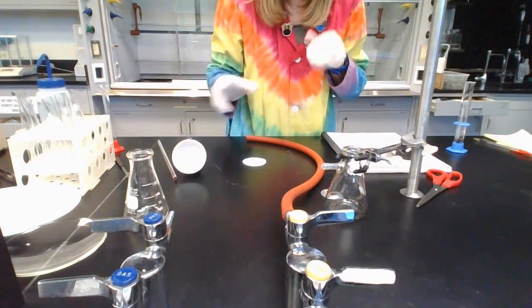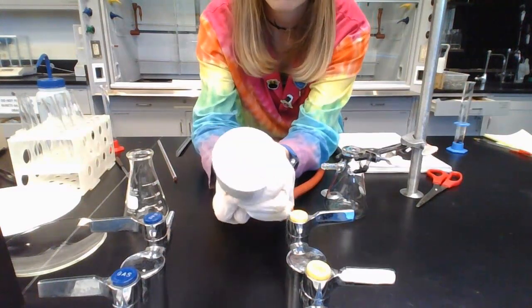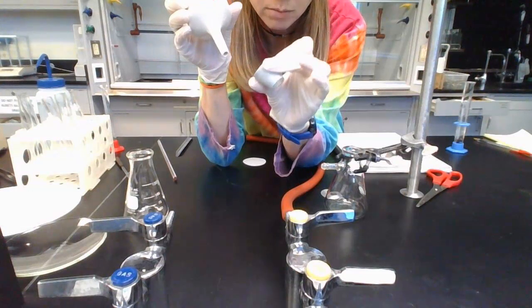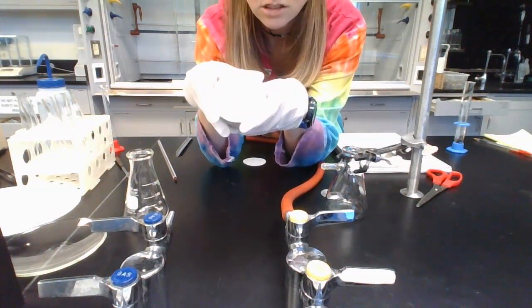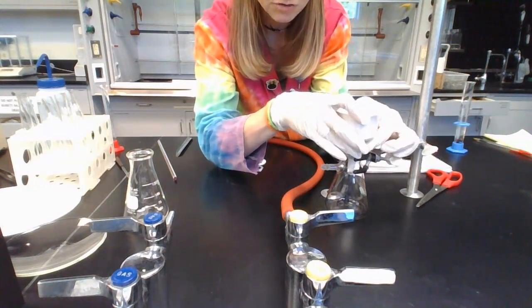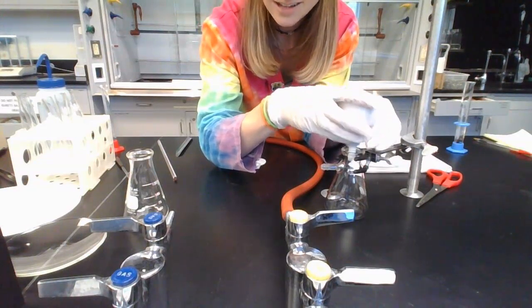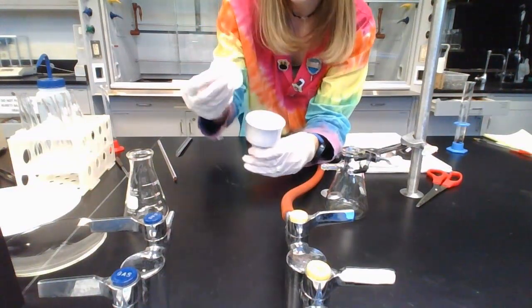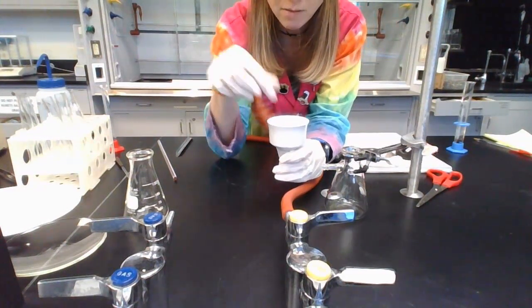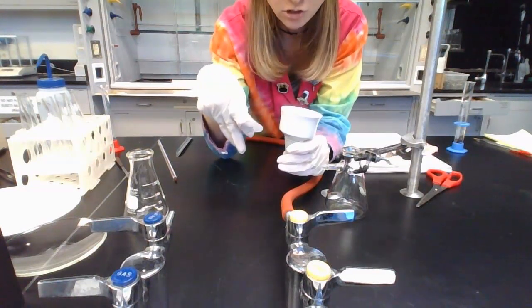Okay. Then you need to get what's called a Buchner funnel. Buchner funnel is this piece of ceramic. I don't know how well you can see it. It has little holes in it. And then there's this rubber adapter. And so it's used to do the filtering. So that fits nice and securely on top of the filter flask. Now, I'm not going to put it on there yet necessarily because I'm not done connecting things, but that's where it's going to go. You're also going to need a small piece of filter paper that's the perfect circle size to fit on that Buchner funnel, because without that filter paper, there's holes. So the solid and the liquid would just go straight down it.